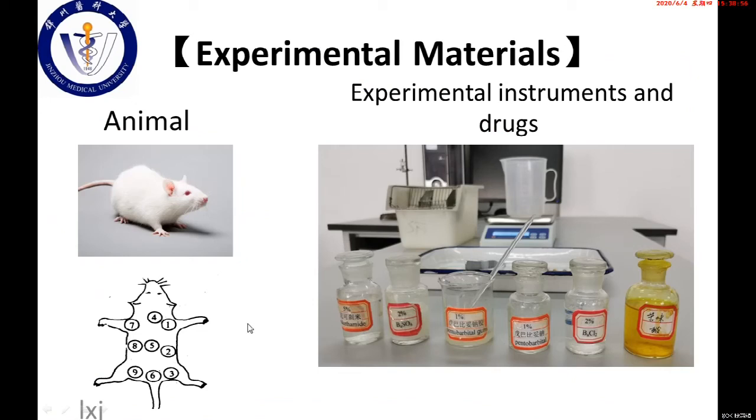Look at the experimental materials. The animals for the 3 experiments are mouse.